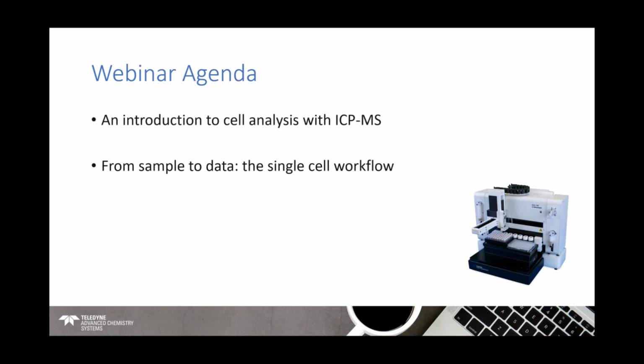I'll be talking for the most part on the idea of a workflow, starting with cells, going through to data, and I'll give some examples of data that's been published recently with one of our collaborators over at the University. So that's what I'm going to go through today. I'll start off with the introduction to cell analysis with ICP-MS.